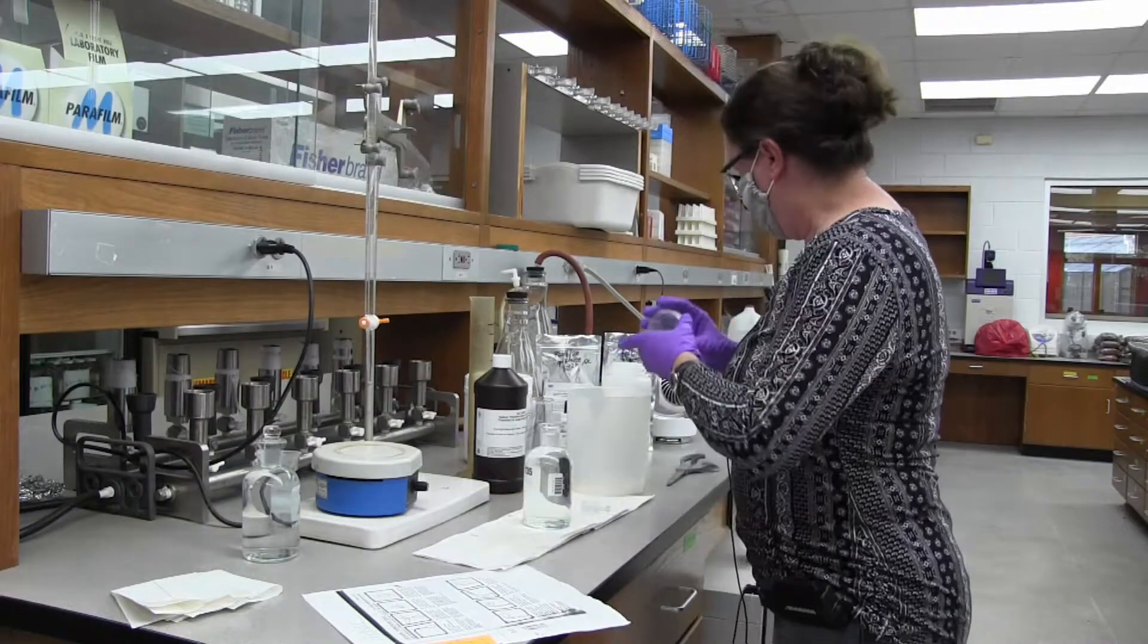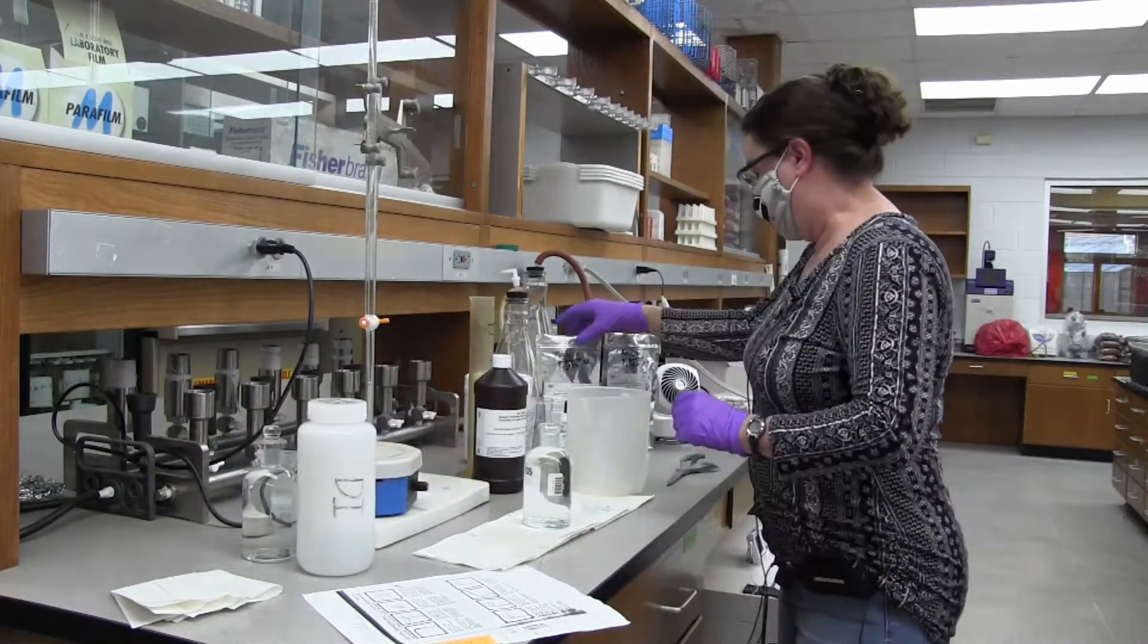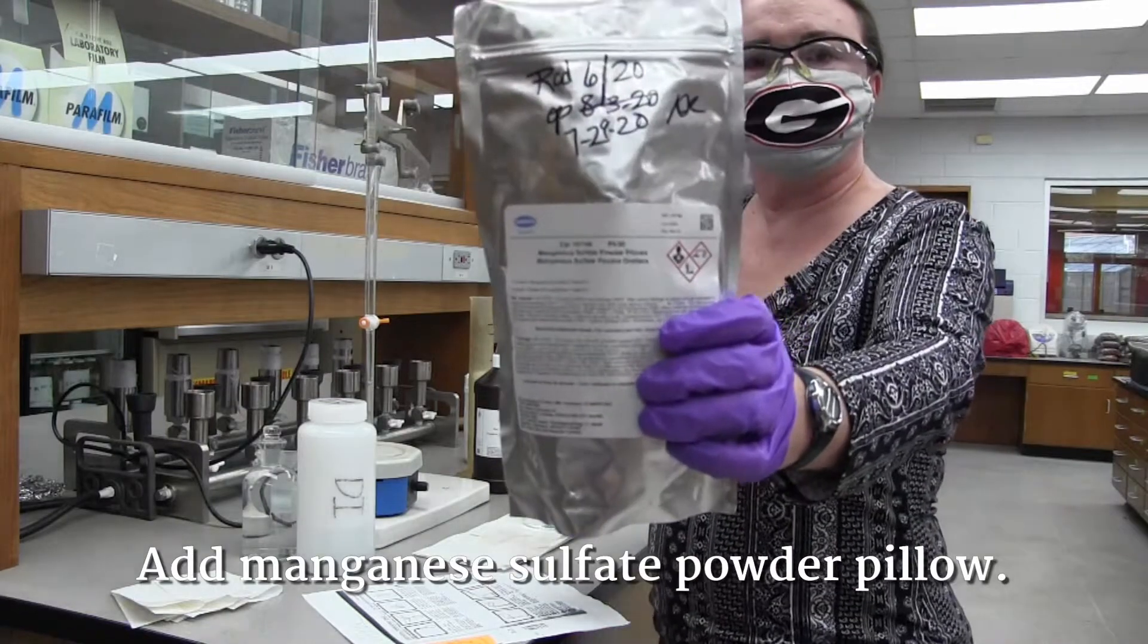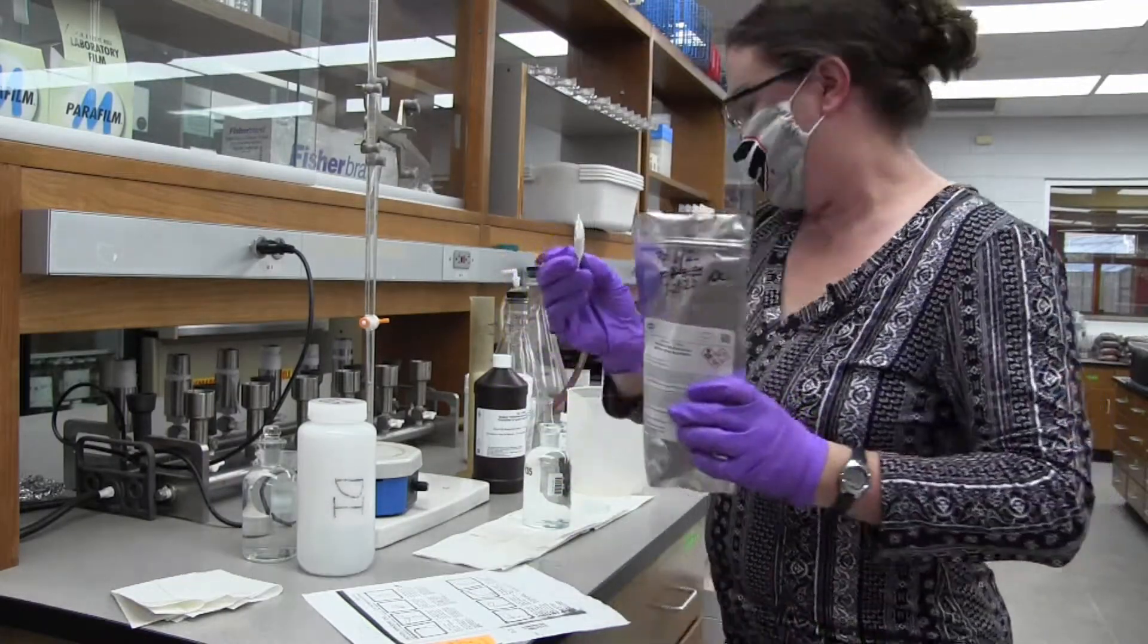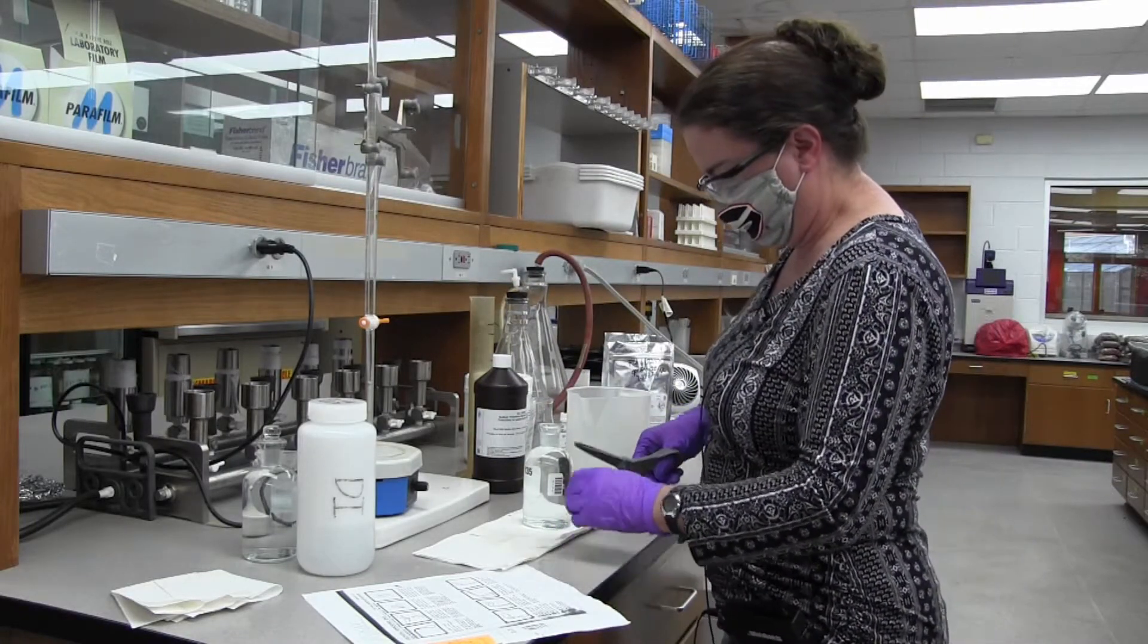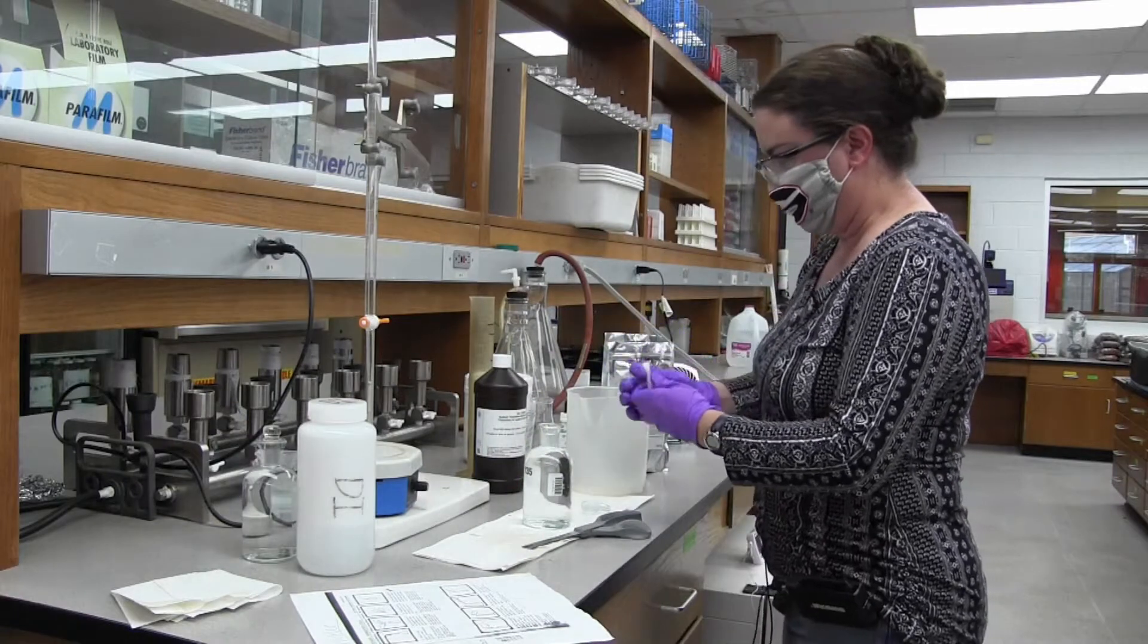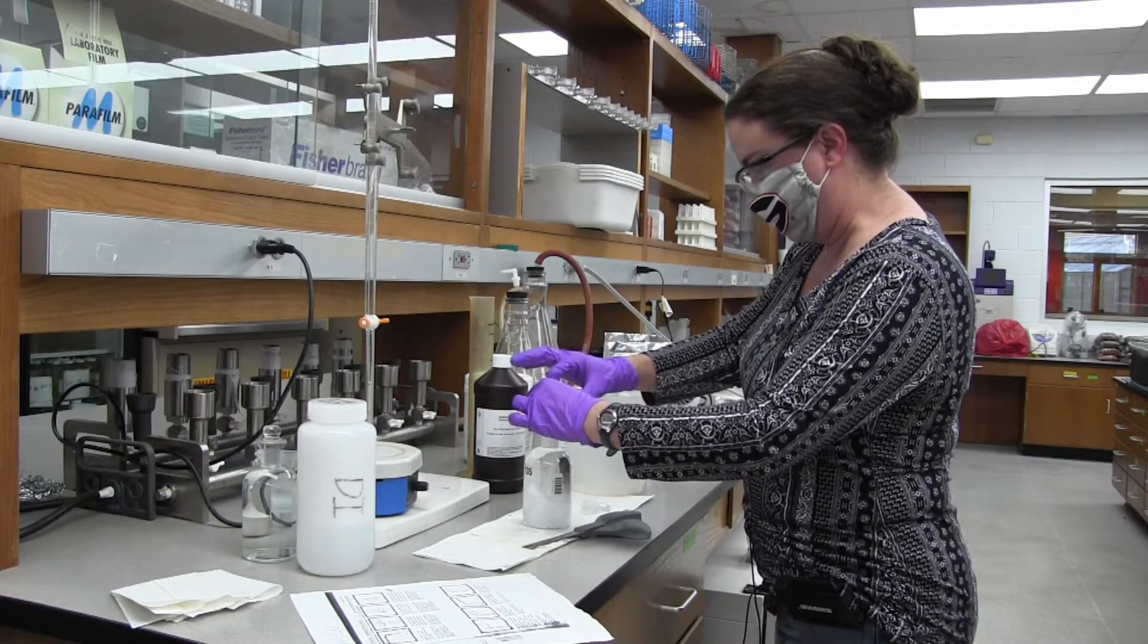And to the one we're going to be using for the titration, we're going to add the contents of a manganese sulfate powder pillow. You can use scissors to open it. You may have to tap the side if there's some left in there.